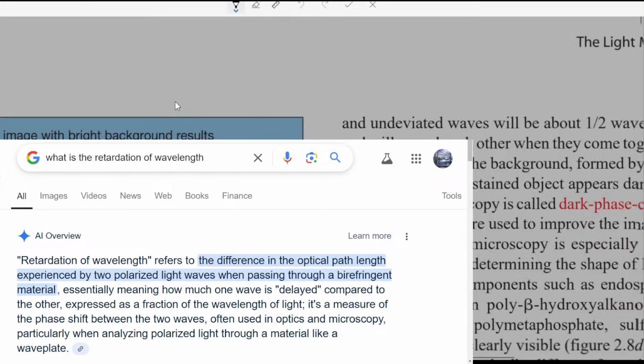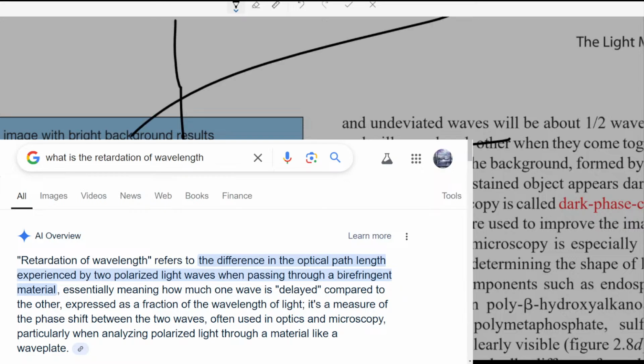Guys, take this line and this line. Now there is a wavelength. Consider this as a 0, the normal point. Now there is a wavelength that is passing through at normal. So cut this wavelength into 4 parts.